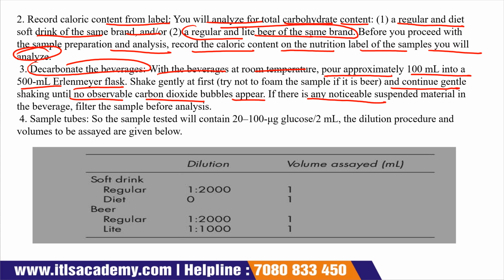If there is any noticeable suspended material in the beverages, then filter the sample before analysis.